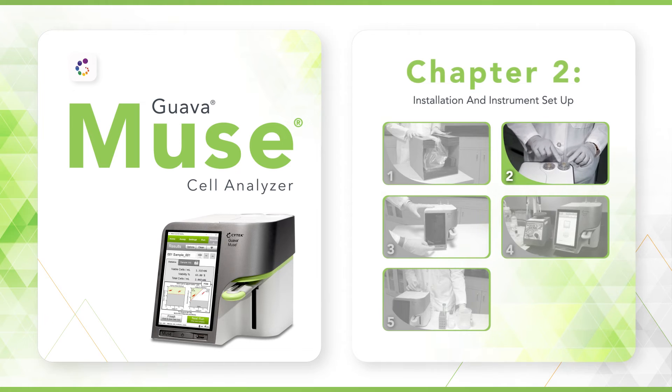This next chapter covers installation and set up of key components so your Guava Muse flow cytometer is ready to operate.